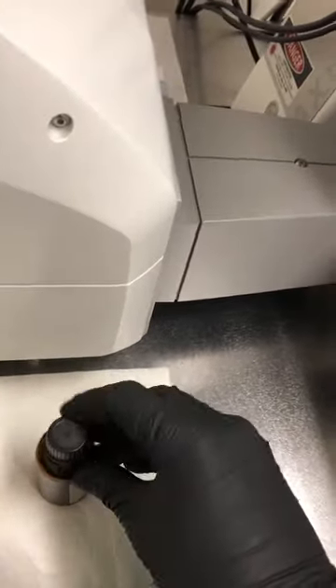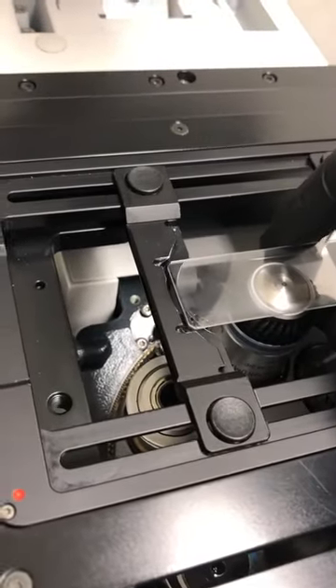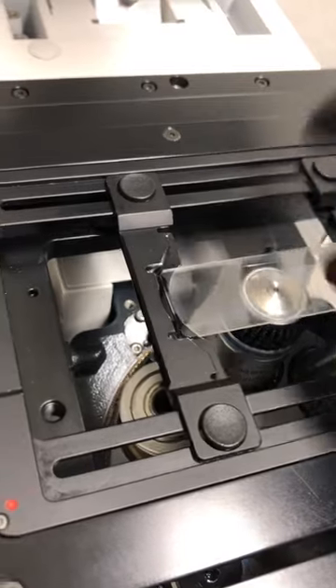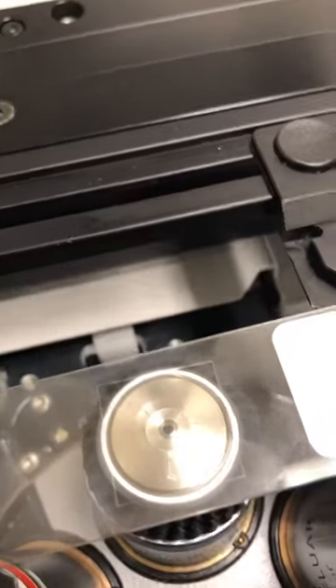I'm going to close that and then put the sample back with the cover slip towards the objective. Then I'll hit the done button here, which will bring the objective up until it touches or almost touches the sample.